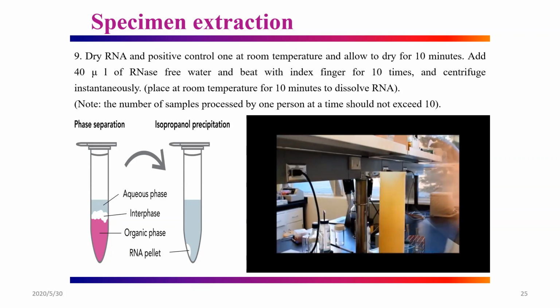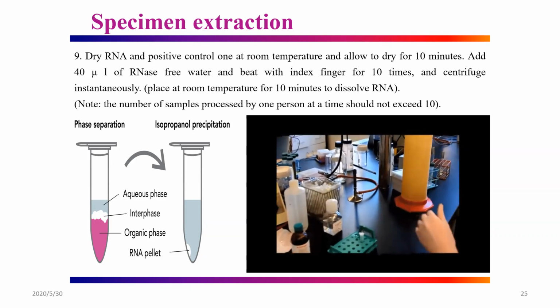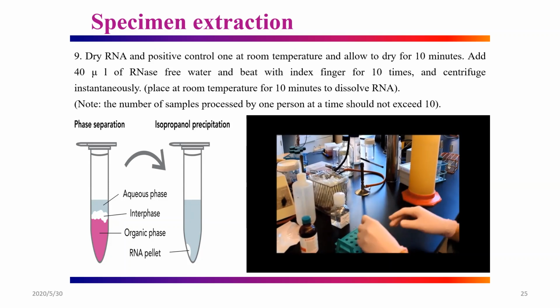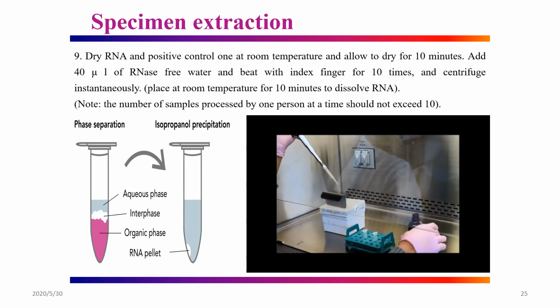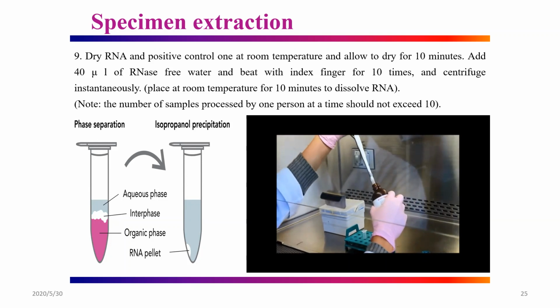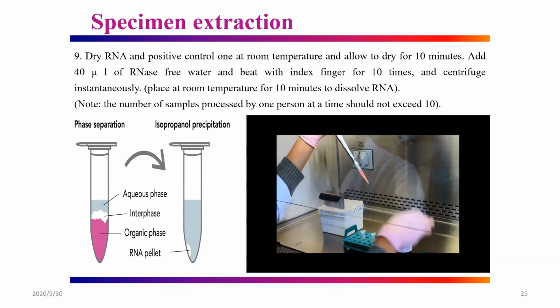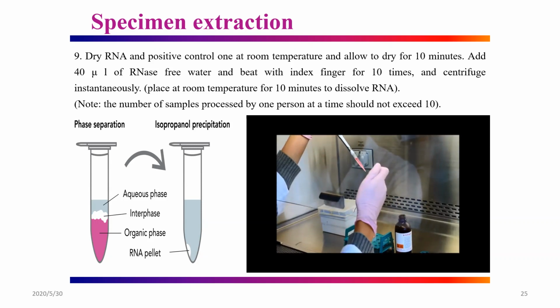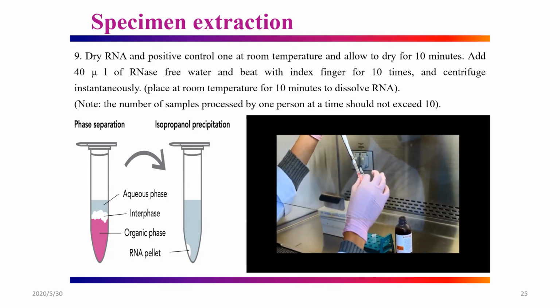After centrifugation, the Luria broth supernatant is then decanted. The pellet is resuspended in Trizol. Lyse cells by vigorously pipetting a few times.